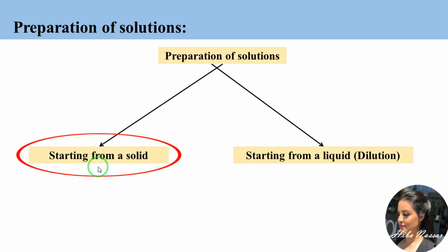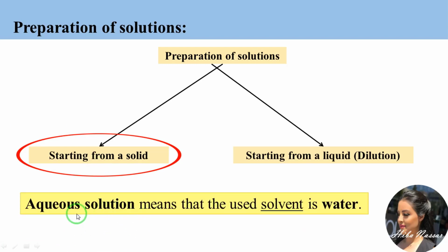But you have to know that all the prepared solutions are aqueous solutions, which means that the used solvent is always water. So what do we mean by an aqueous solution? It means that the used solvent is water.